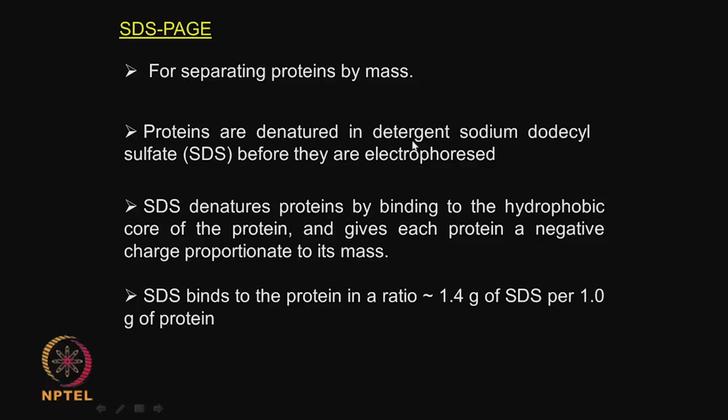Proteins are denatured in detergent. So, why do you call it SDS? Sodium dodecyl sulfate. This is a surfactant. What it does is denature the protein. So, the protein sort of binds, or it forms agglomerates. That is what happens actually.